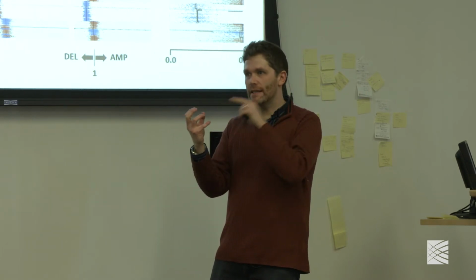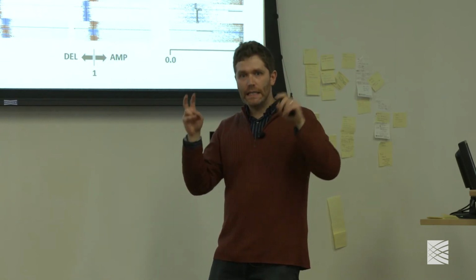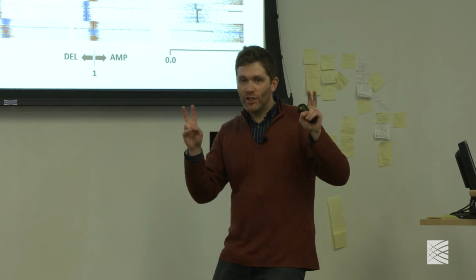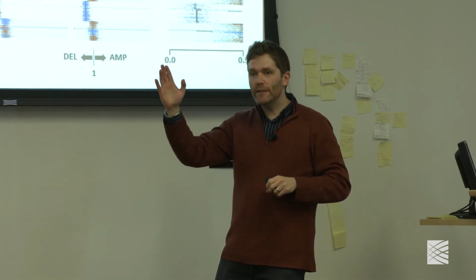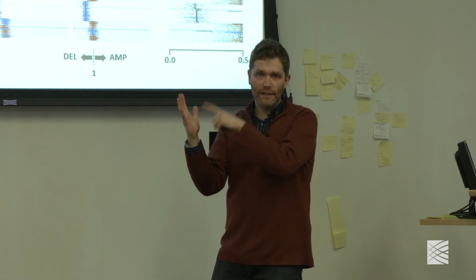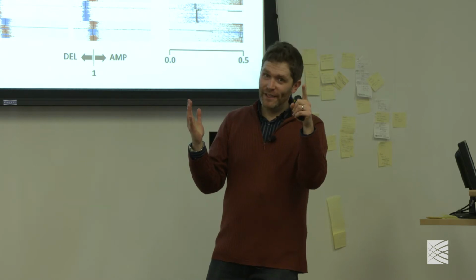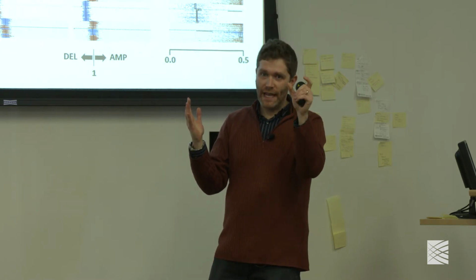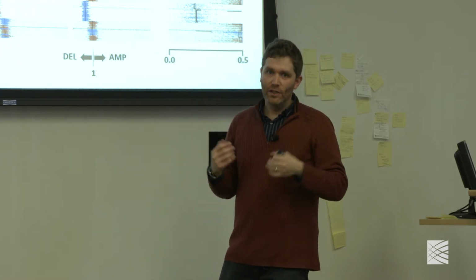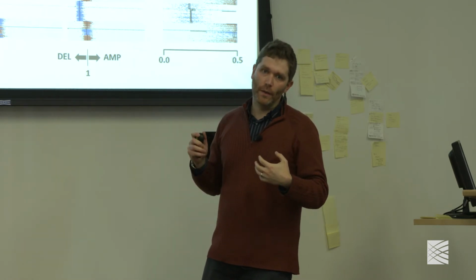And what it does is it says that going from the case sample to this projection is the least error in the hyperplane. Now, by the fact that you're in the hyperplane, intuitively this projection is the closest thing to a normal for this case sample. So then what we do is we just subtract the projection from the case sample, and it pulls out all of the systematic noise that you would have seen if you were sequencing a normal.